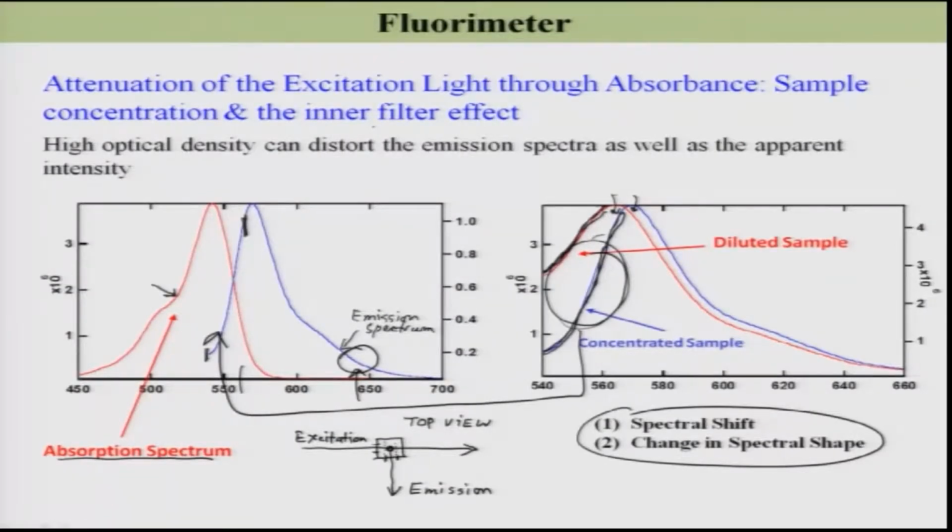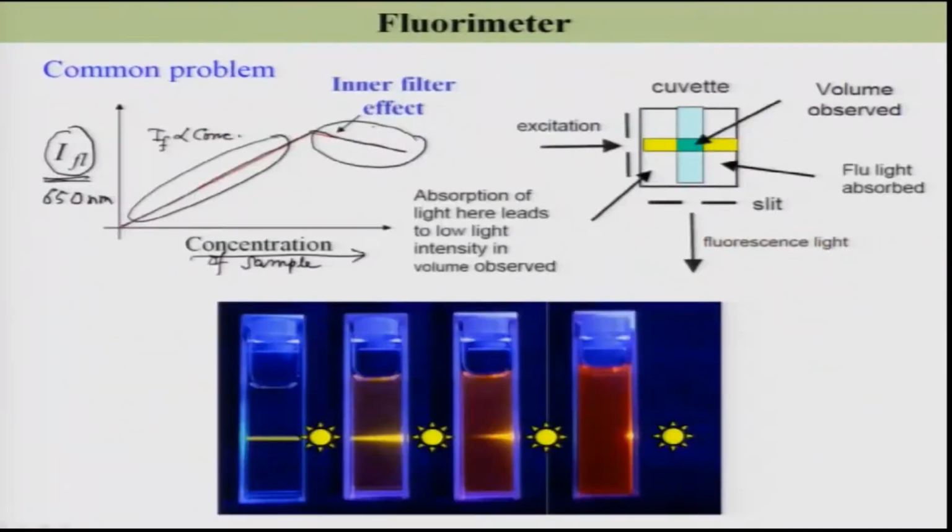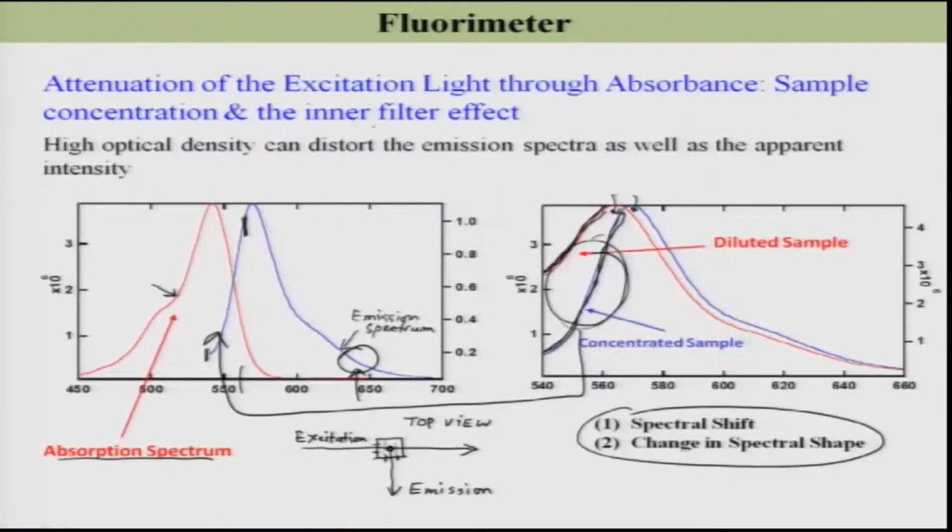In this particular experiment, I have set the excitation wavelength as, for example, 520 nanometer excitation, and 650 nanometer emission. Please note it, I will highlight it.